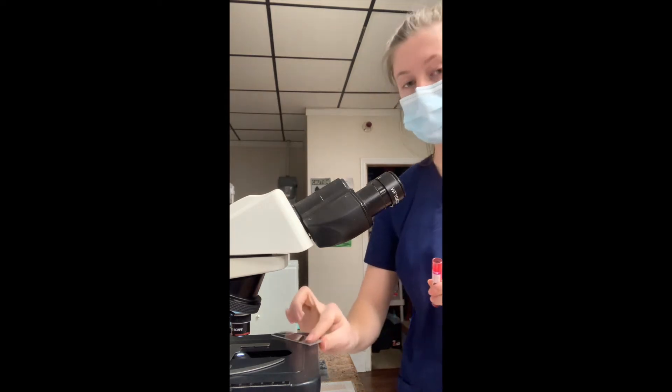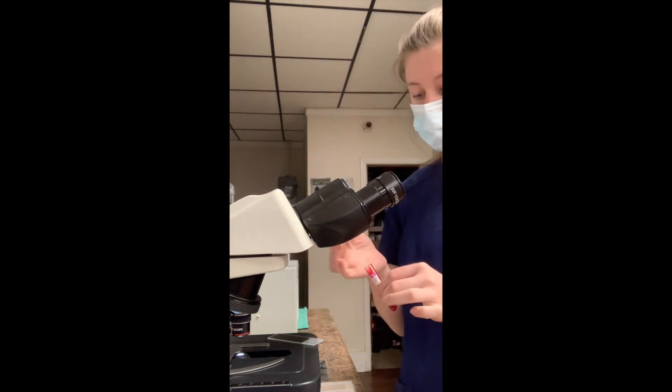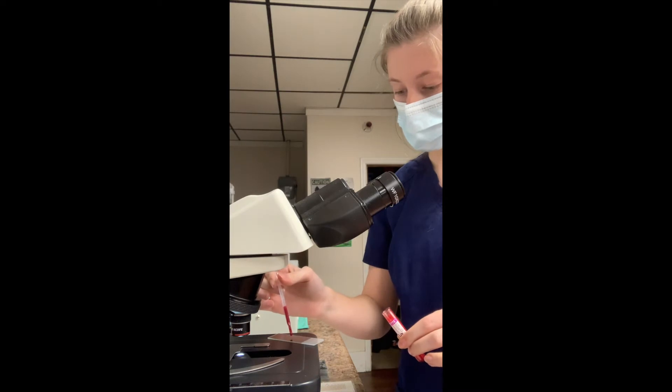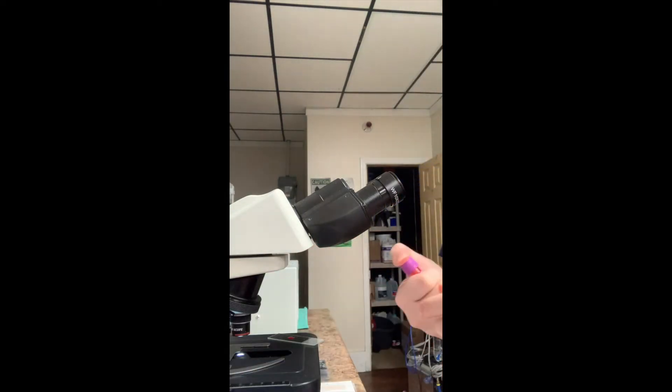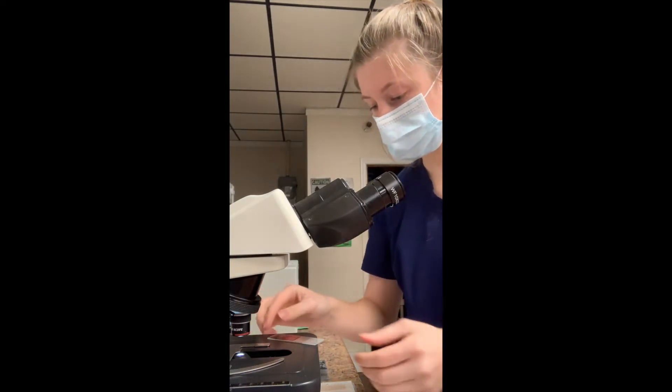I've got my slide and my cover slip over here. I'm going to take one drop of blood, place it on the slide, and place my cover slip directly on top.